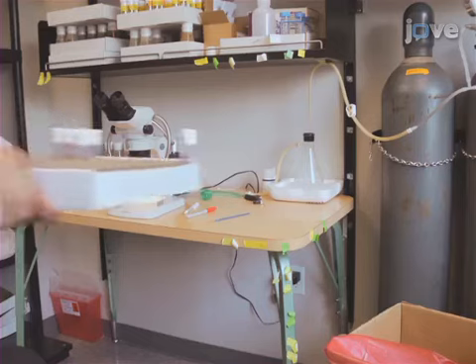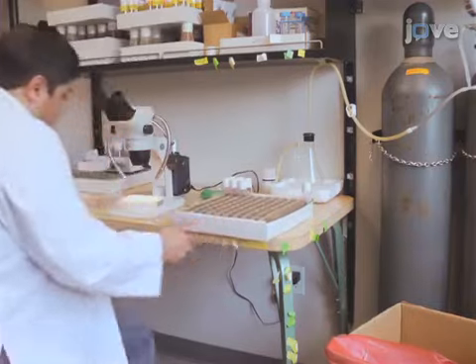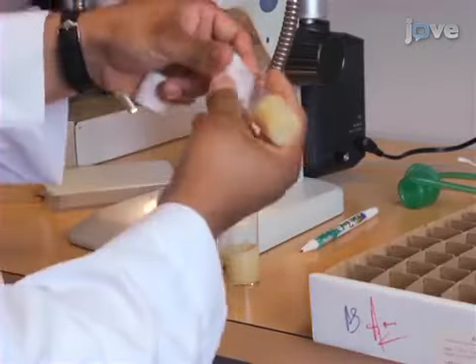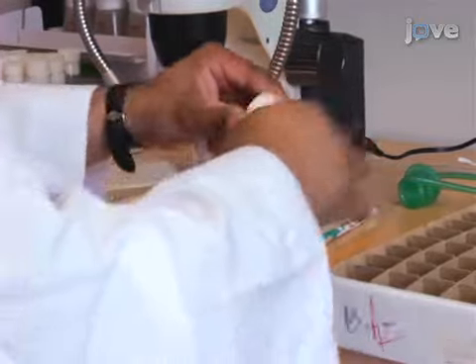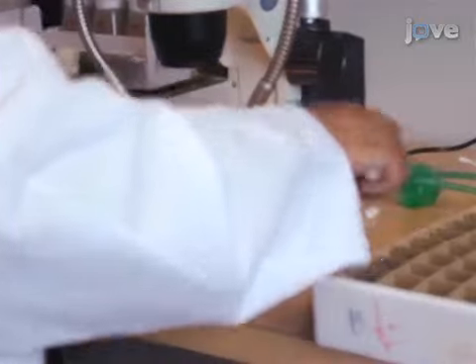Allow the flies to mate and lay eggs for 24 to 48 hours at 25 degrees Celsius, and then transfer them to a fresh vial to produce more progeny. Monitor the cross vials.